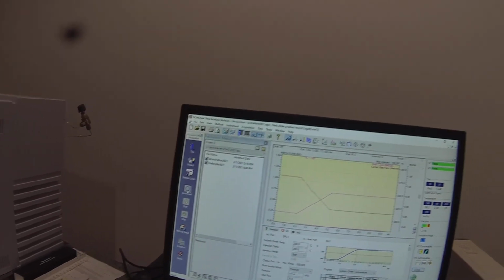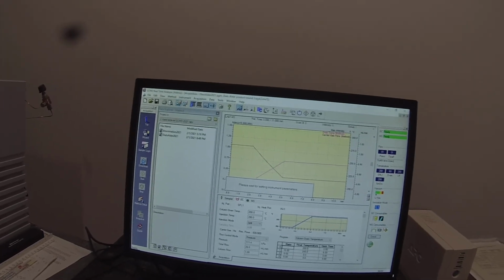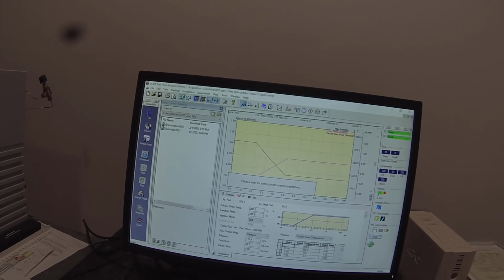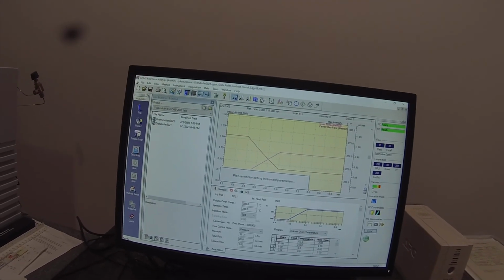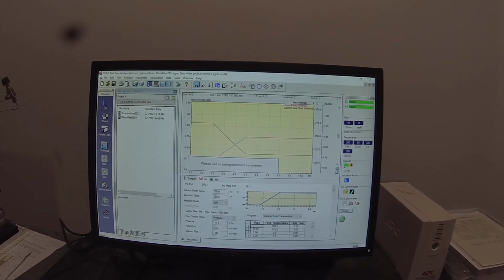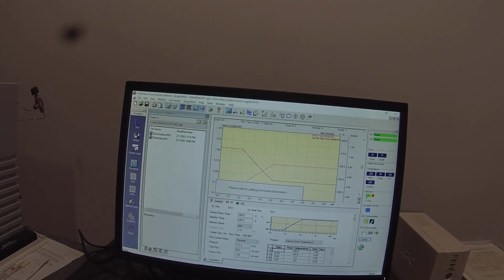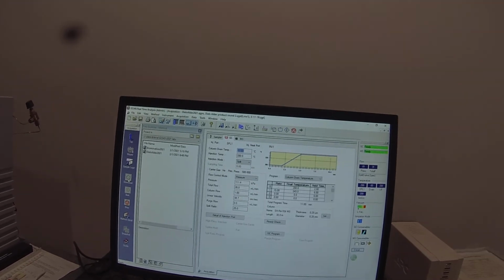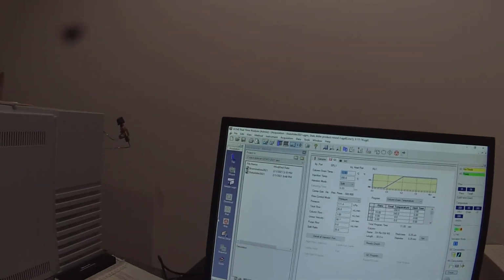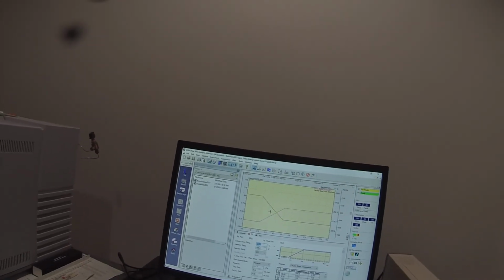And download parameters again, and this will run that second sample a lot hotter for a lot longer, and hopefully get our compound to come off. We're going to be sitting at 245 degrees for a good long time, and we know from the gas chromatography that at that fairly high temperature the Diels Alder adduct does come off. So we'll just let that run and come back when it's done.